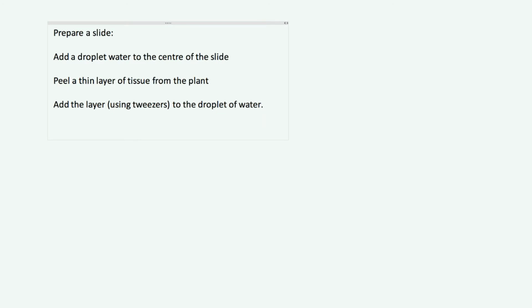Okay, then what we do is we add a stain. Remember I told you in the last video that in order for us to see the cells, because cells pretty much are going to be just clear, okay, they're not colored, and so we can't really see anything. We add a stain and it makes some parts of the cell darker. Not the whole cell normally, but just some components of the cell darker. And depending on what stain we use, we're going to get different appearances of our cells. Okay, so we're going to add a stain.